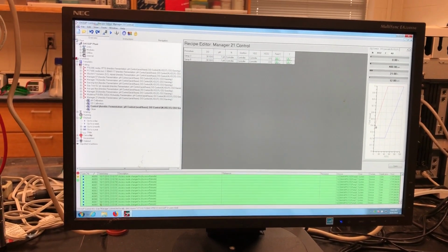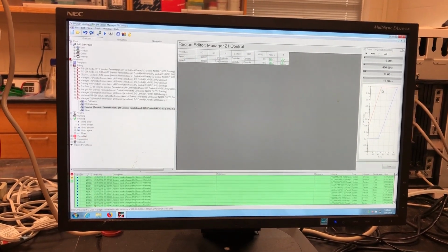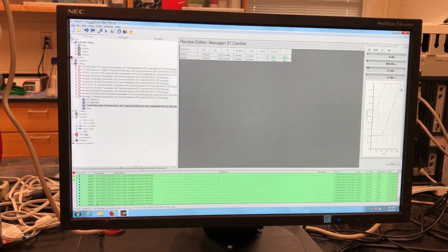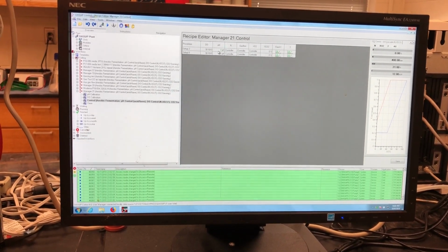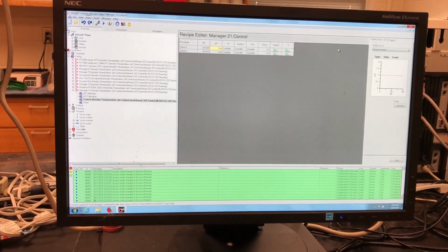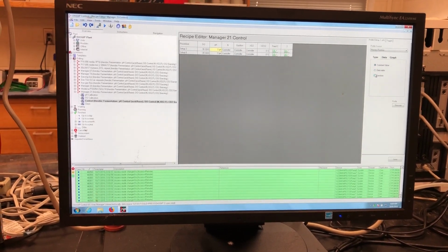And then we have the cascade set up so that it increases agitation first, followed by an increased oxygen percentage. And we typically use a steady flow rate for gassing. Most clients want the gassing rate to remain about the same. And then for pH, we have a very similar set of controls for that. You can use the same sort of different control schemes.